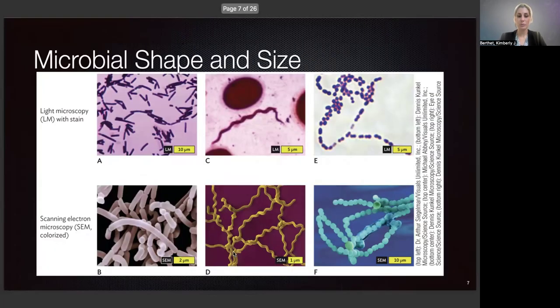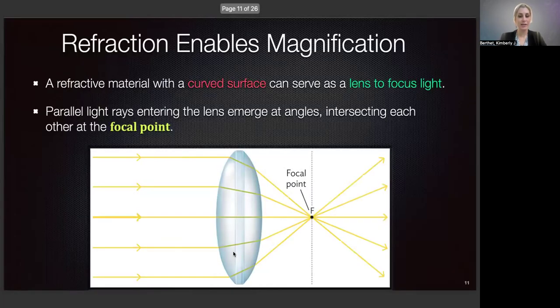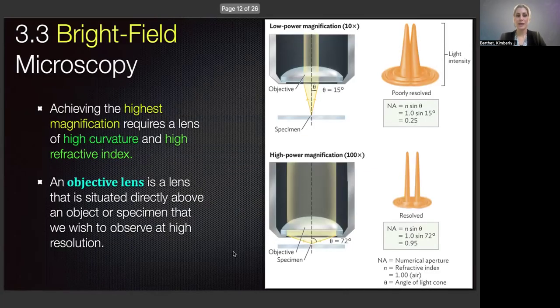So a microscope is working similar to how our eye actually works. Okay. When we talk about resolution, again, it's about defining the difference between 2 points. Here we can see 2 points that are barely resolved. So we see poor resolution. These might look blurry, and you wouldn't be able to distinguish the fact that there's 2 points here. On the other hand, we have 2 points that are highly resolved. We see them as 2 separate individual points.